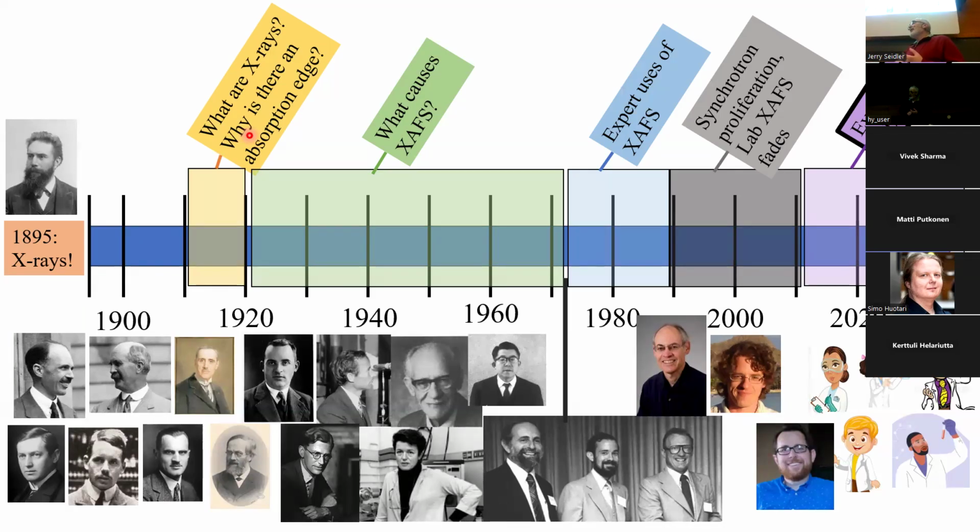So one important thing would be to include XAFS in teaching, which in some cases could be done with home-built or commercial machines, but those are rather expensive, and something we've worked on and off is coming up with an inexpensive one-element spectrometer for instructional purposes. So I would say instruction is one forefront. A possible outcome, partly with instruction, partly with instrument development, is the use of XAFS in quality assurance in industrial manufacturing.